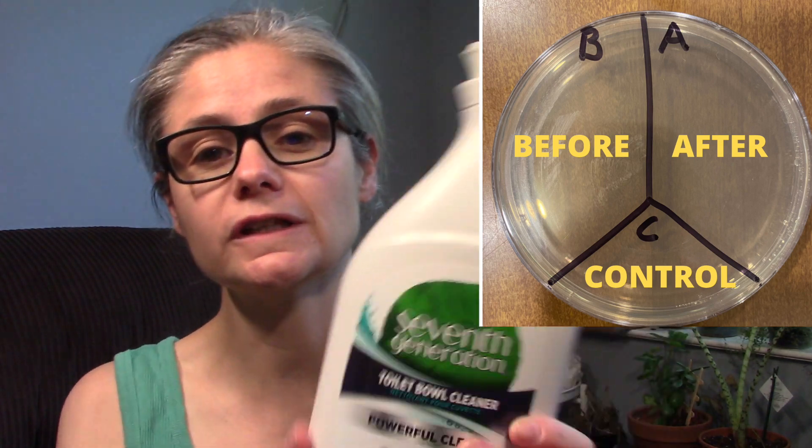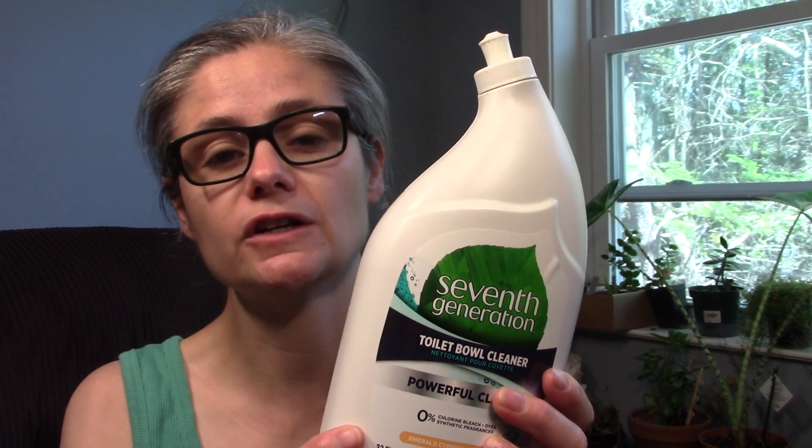I'm going to test this Toilet Bowl Cleaner just like I do all of my other bacteria testing. I'm going to get a Petri dish and label it A, B, and C. I'm going to swab the toilet bowl using a sterile swab and place that sample in section B for before. Then I'm going to clean with the 7th Generation Cleaner.